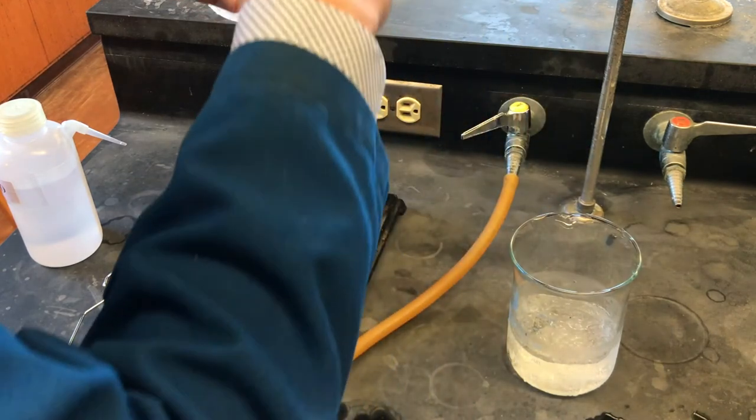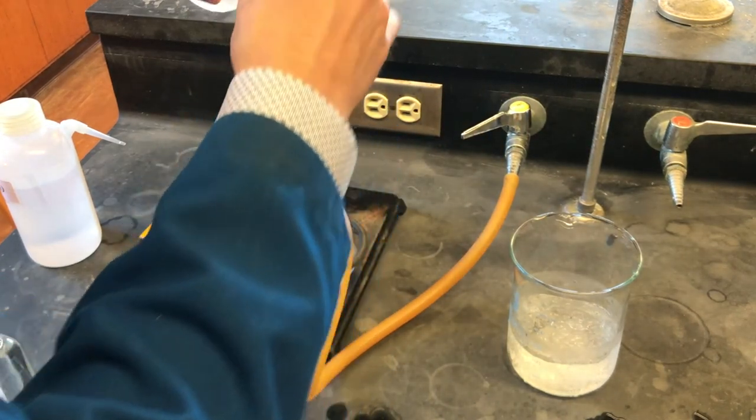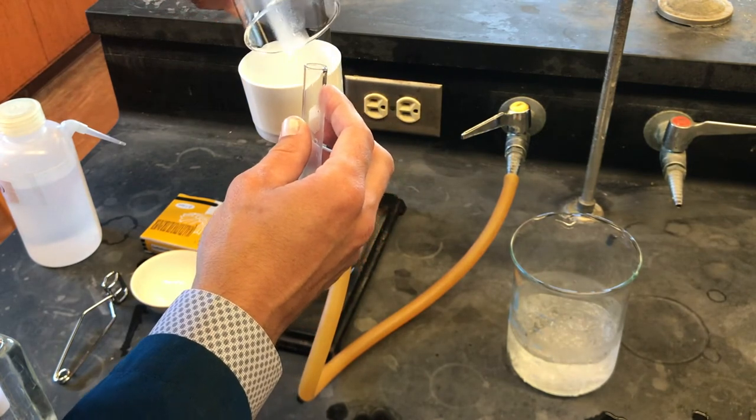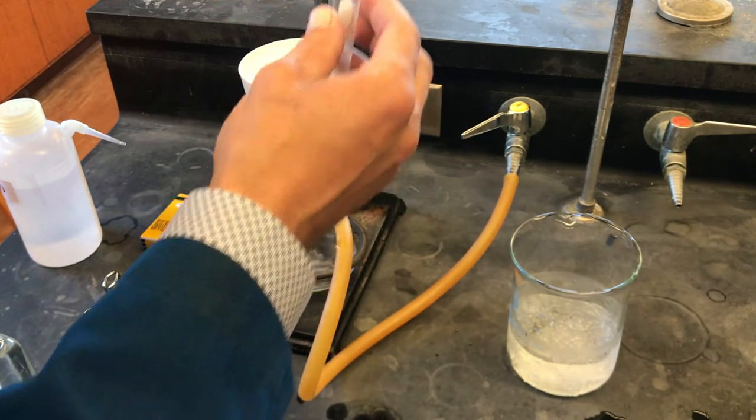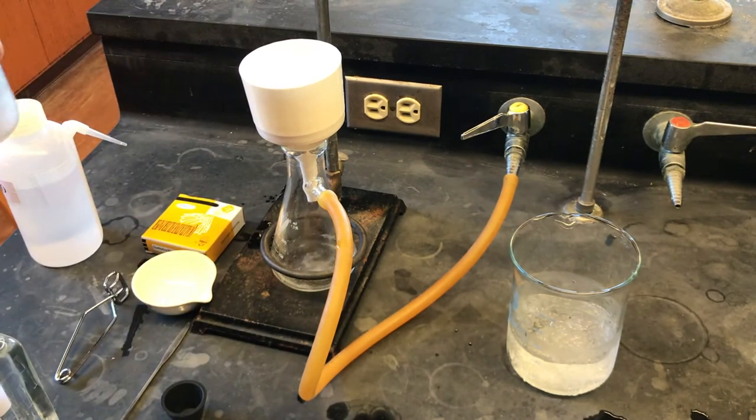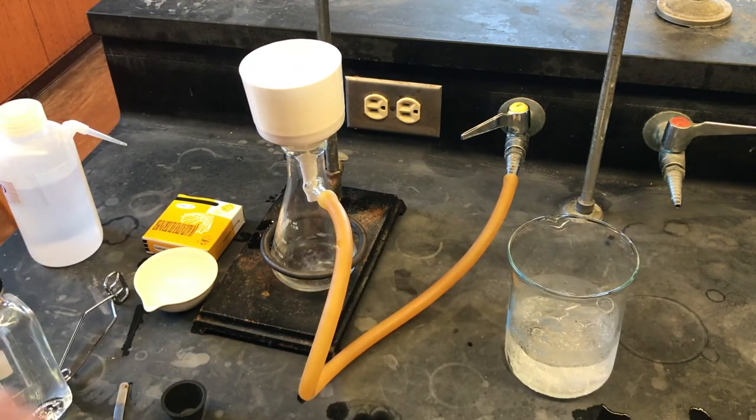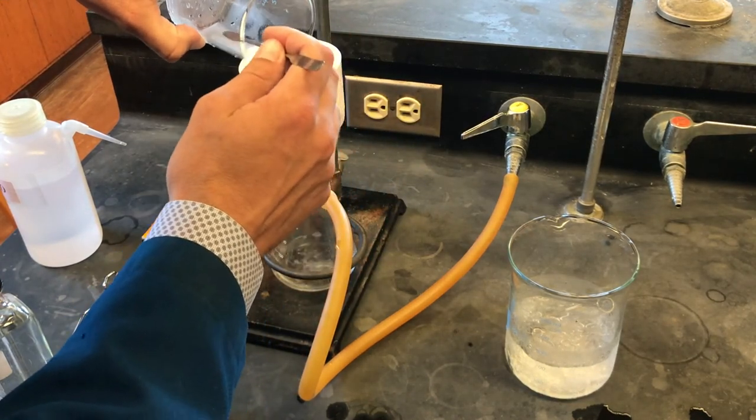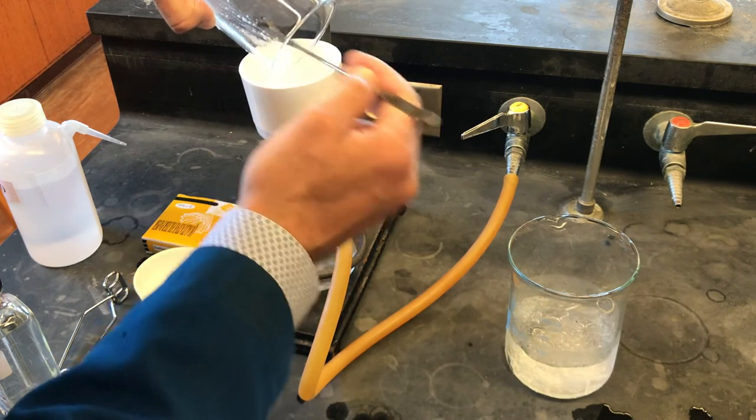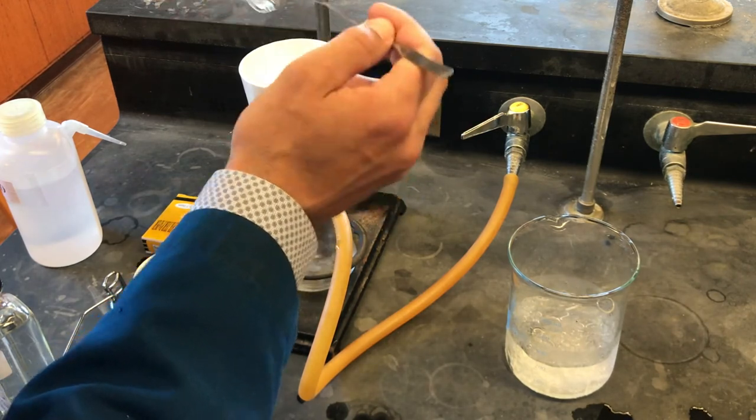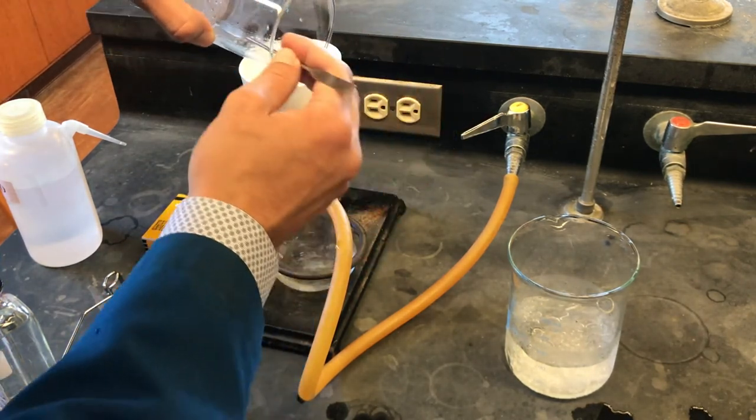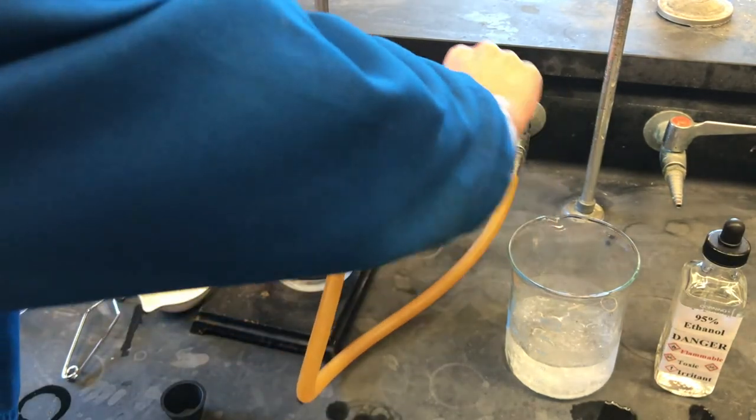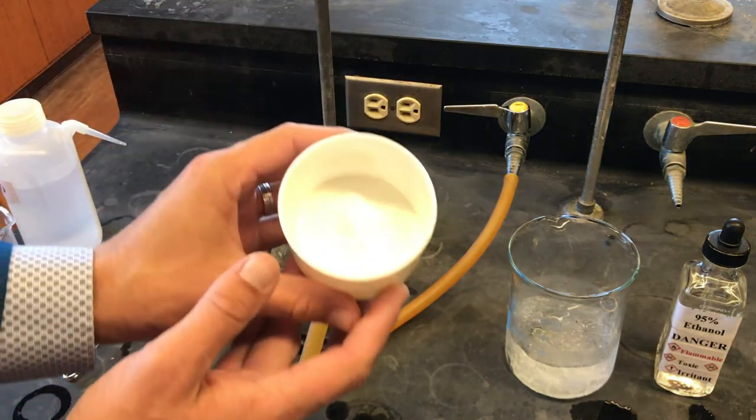We will use cold 95% ethanol to rinse our reaction beaker and retrieve the remainder of the potassium alum. Potassium alum has low solubility in ethanol, especially at low temperatures, which reduces the chance of it going back into solution and passing through the filter paper. We may also manually scrape the remainder of the crystals onto our filter paper. Any material remaining in our beaker will reduce our yield that we calculate at the end of the experiment.